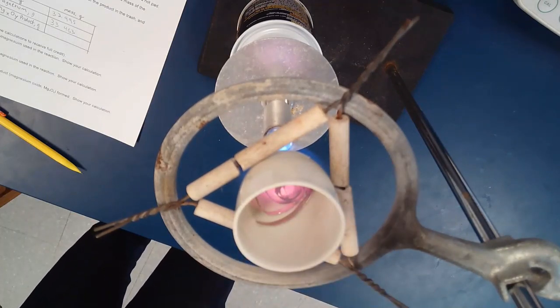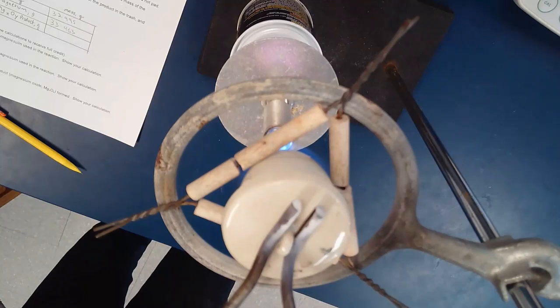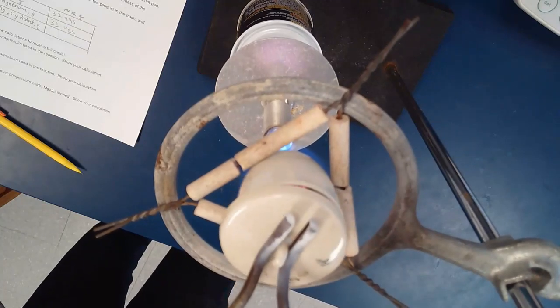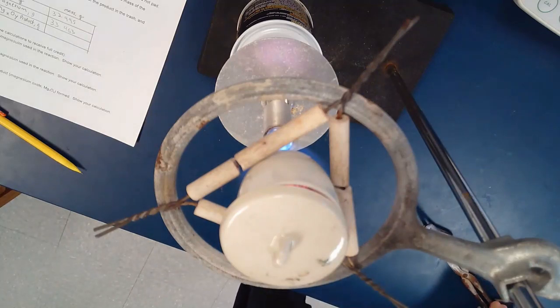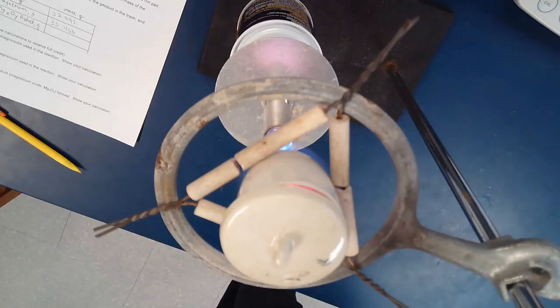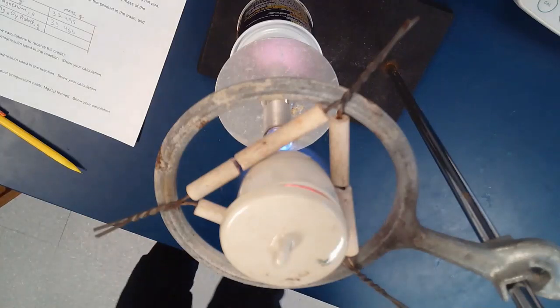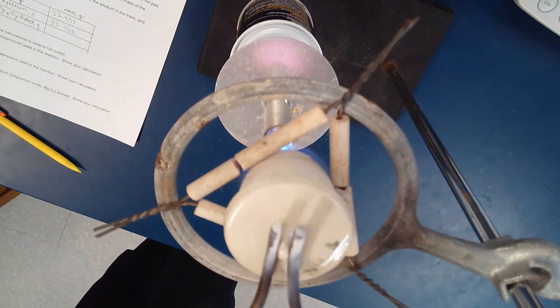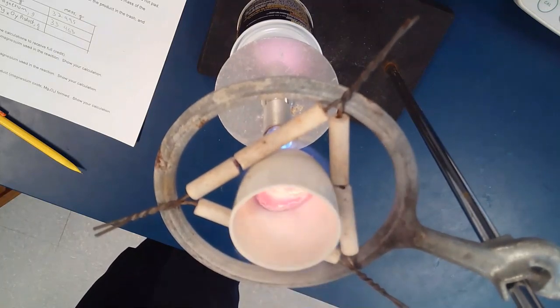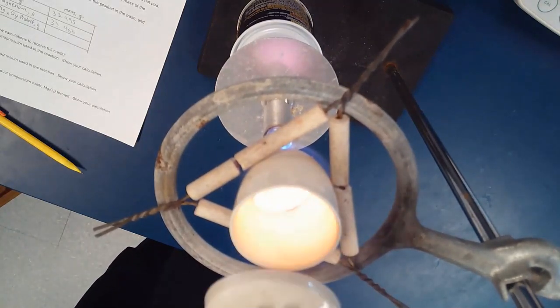You see our magnesium? Smoke coming out. Okay, you probably can't see it on the screen, but we can see some white smoke. Maybe Mr. McGinnis can lift the lid off quickly. There you go. There's that reaction.